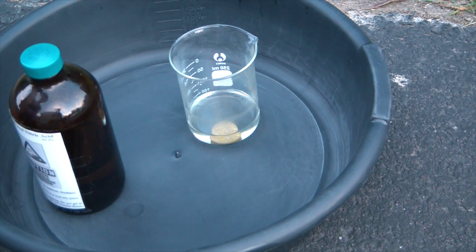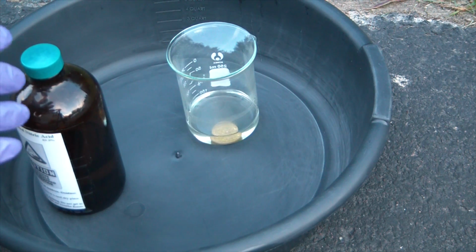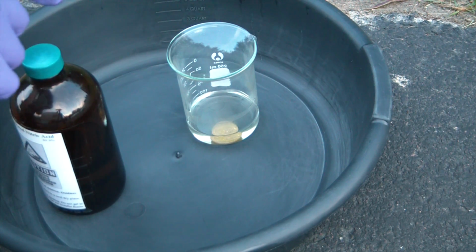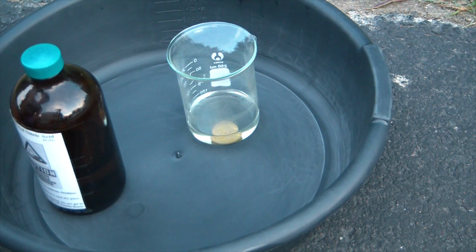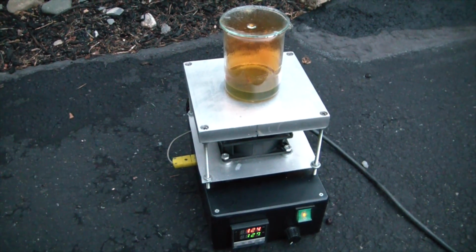Alright, so we're going to leave this to dissolve for a little bit. I'm just going to throw a watch glass over top of it. That's going to help recondense any nitric acid fumes that evaporate off. And it's also, more importantly, going to help prevent any impurities, such as this grass out here, from blowing in and contaminating our nitric acid solution, which will soon become a solution of silver nitrate and copper nitrate.